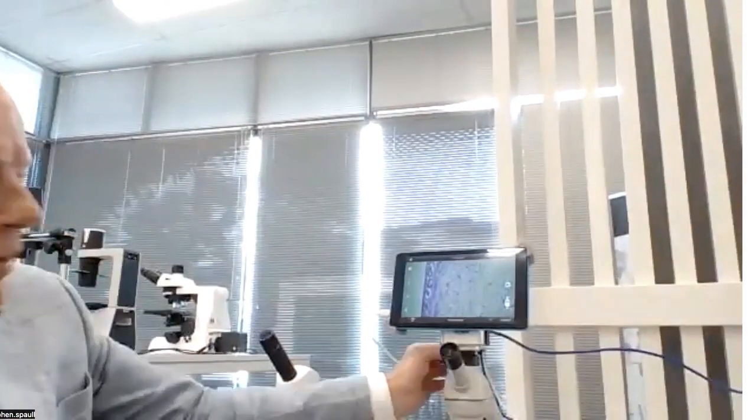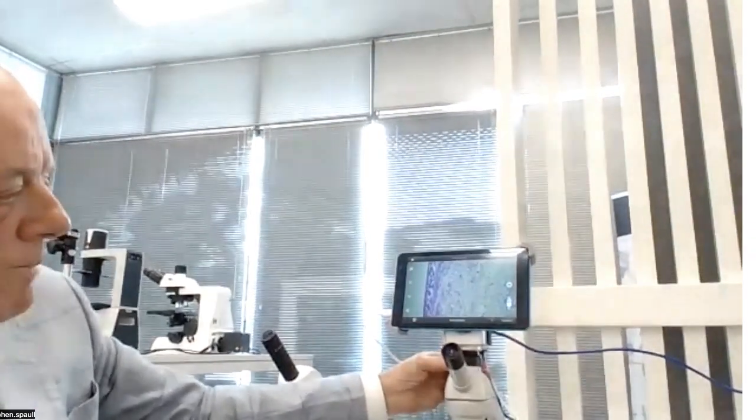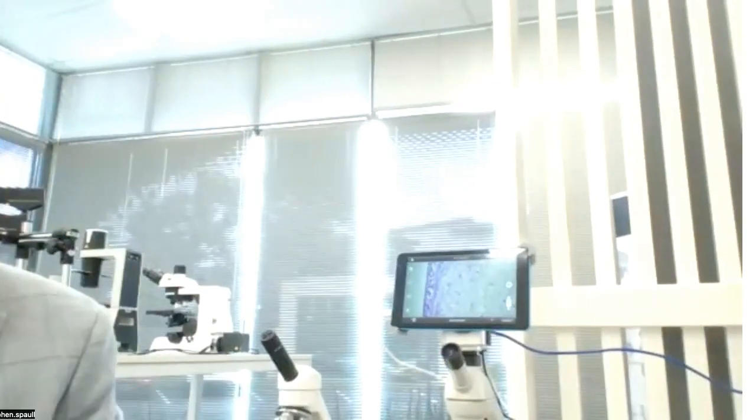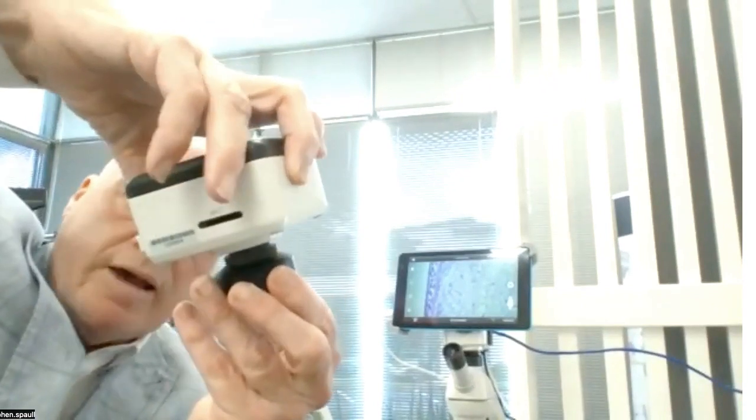So basically the things you need to view an image on a microscope, you need a C-mount adapter, which is this device. This device connects into the video port on a microscope. If you've got any questions in between, please ask. So basically you need that to start with. So you have the microscope here. The C-mount is under there, so it slots in just on the head of the microscope, and the camera then attaches to that. So you have the camera that will actually screw onto that.